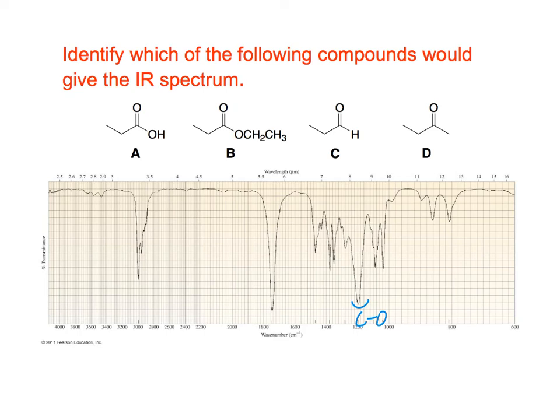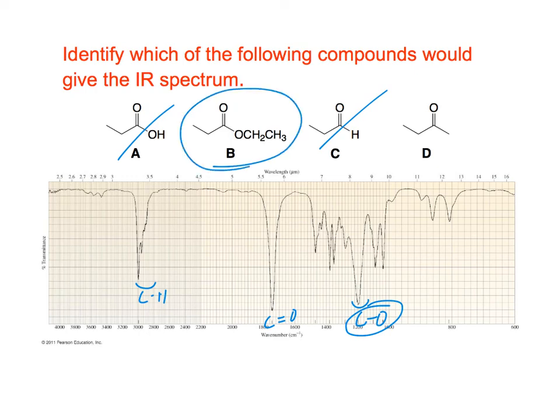So that'll narrow it down pretty good. And here, C8. Right, which ones can we rule out? A and C we can rule out. And then between B and D, it's all a matter of whether this is really a carbon-oxygen stretch or not. So I would say, I think it was B.